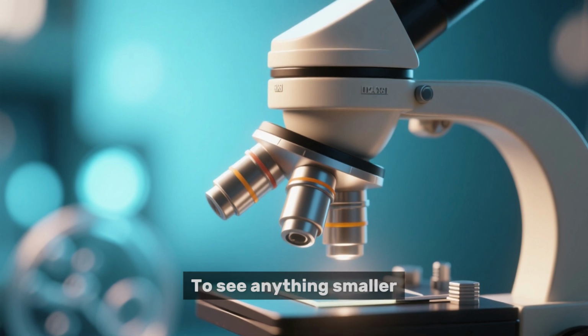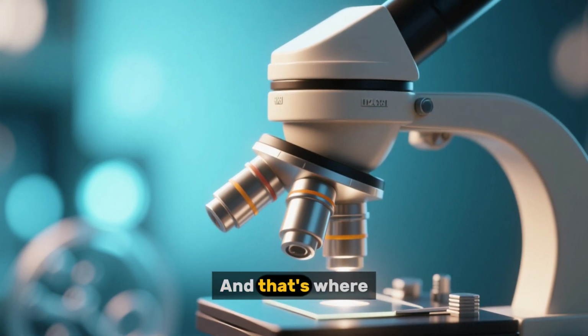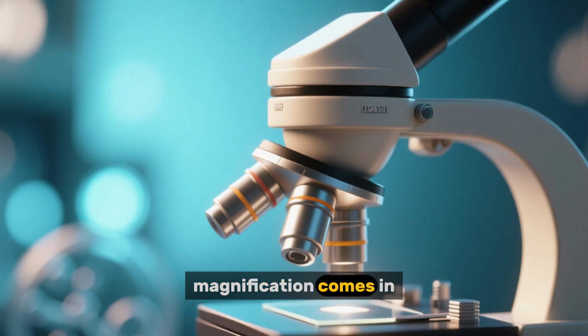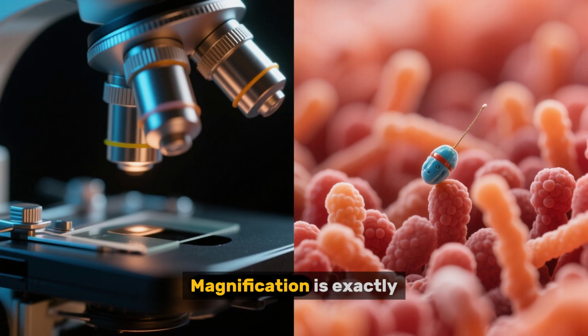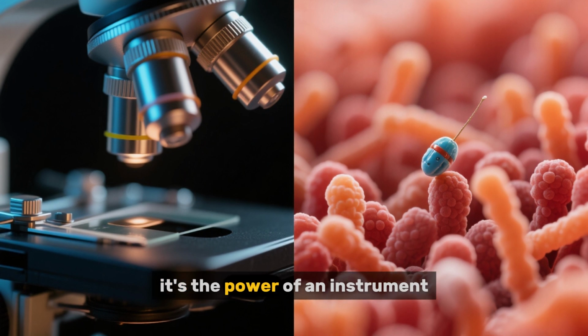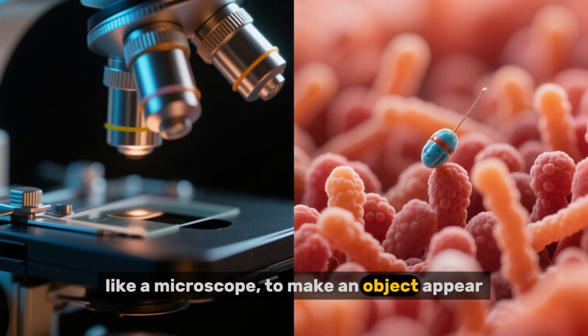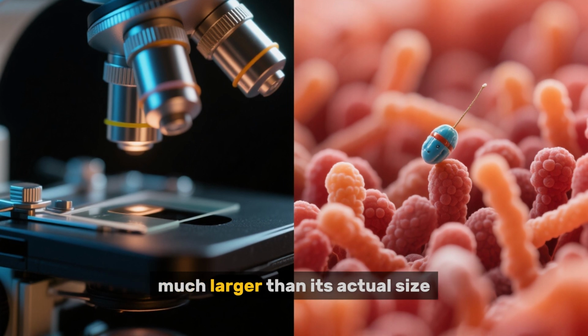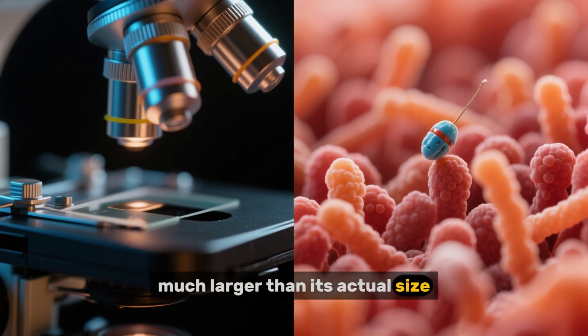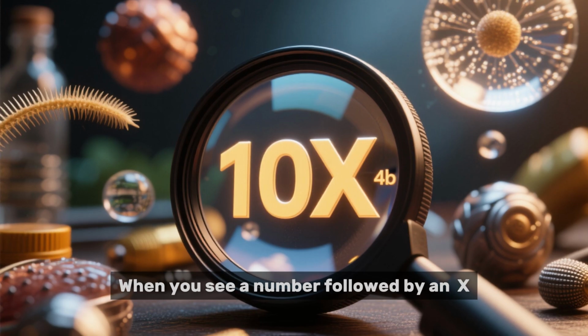To see anything smaller, we need a little help. And that's where magnification comes in. Magnification is exactly what it sounds like. It's the power of an instrument, like a microscope, to make an object appear much larger than its actual size. Think of it like zooming in with a camera.